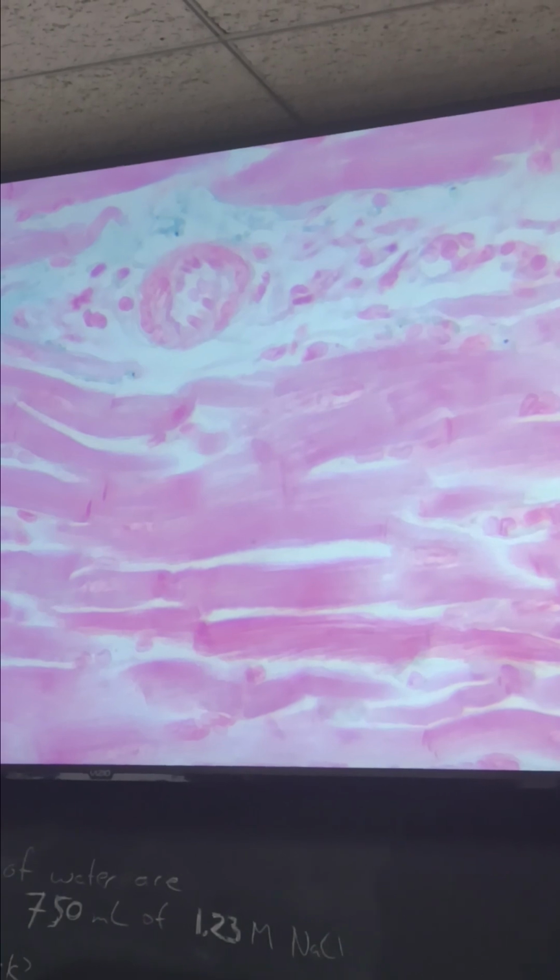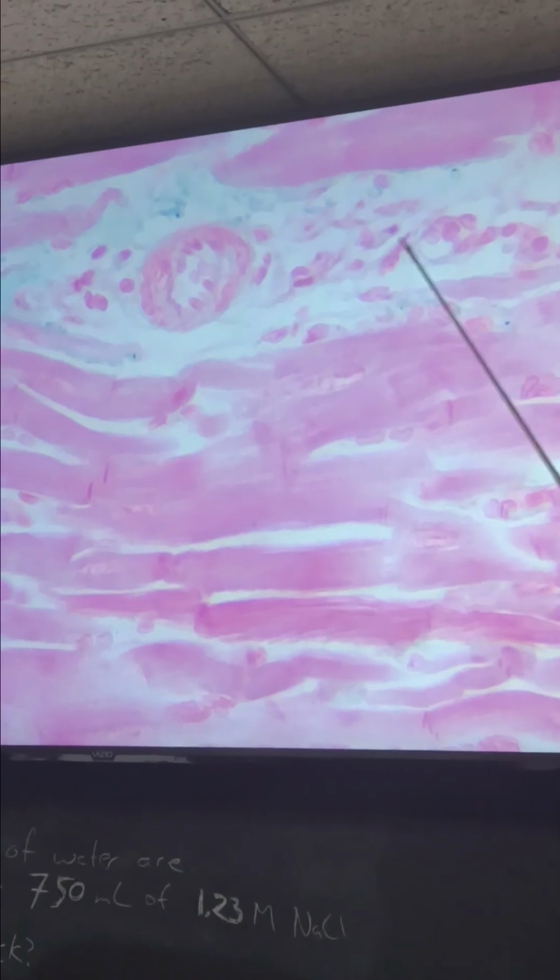What do you think this structure is in this structure? Blood vessel. Blood vessels, yeah. And so what epithelium goes with blood vessels every single time, 100% of the time? Simple squamous epithelium. Okay, so what do we see besides those? What do we see in this area?